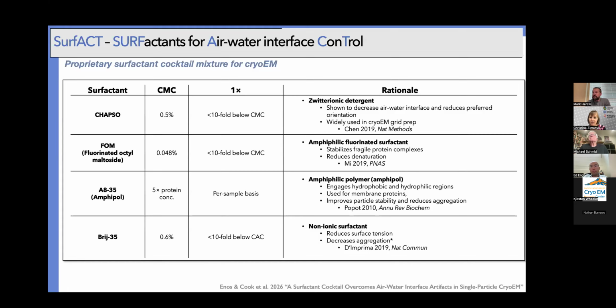I would say that we have not at this stage strived to increase particle density for any of these samples based on what we've shown. What we showed in these images is what went into the reconstructions. And at those particle densities, with the conditions that we have in the paper, most of the reconstructions went into the low 2 angstrom range.